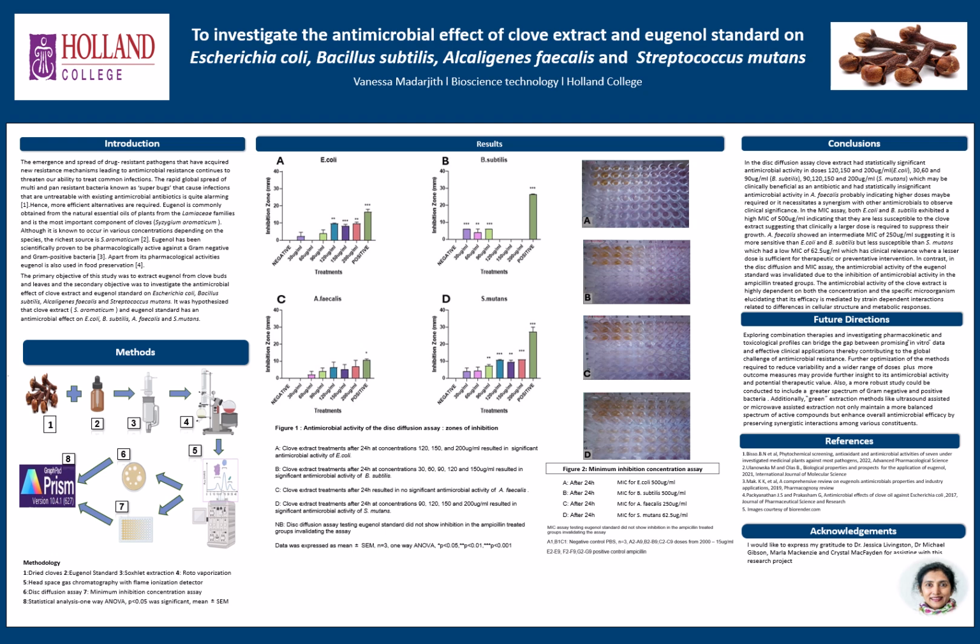In the MIC assay, both E. coli and B. subtilis exhibited a high MIC of 500 micrograms per mL, indicating that they are less susceptible to the clove extract, suggesting that clinically a larger dose is required to suppress their growth.